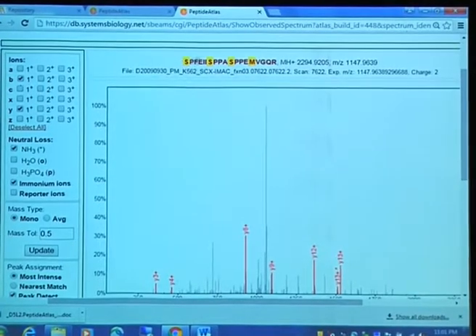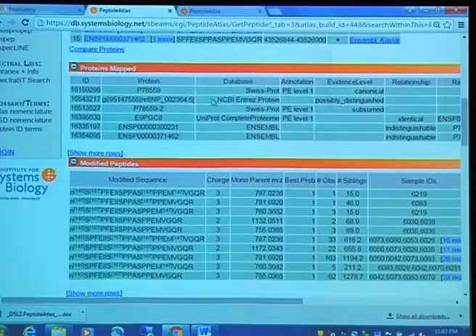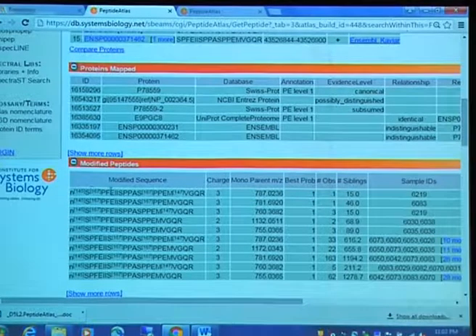So in this case, all 3 serines are phosphorylated, and the methionine is also modified. Over here it says it's a +2 charge. Oftentimes this has a /2. Sometimes the information is a little bit difficult to see, but essentially in order to see which ones were identified as phosphorylated, you look for this mass modification.